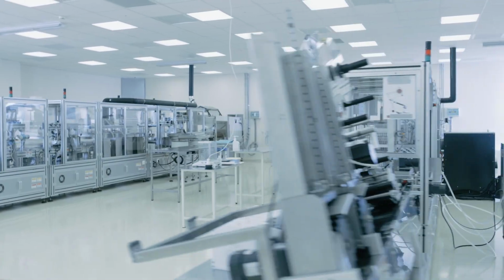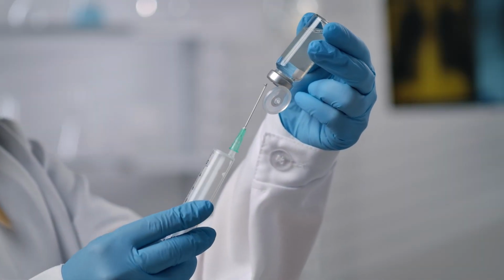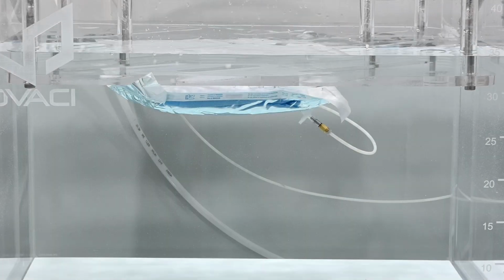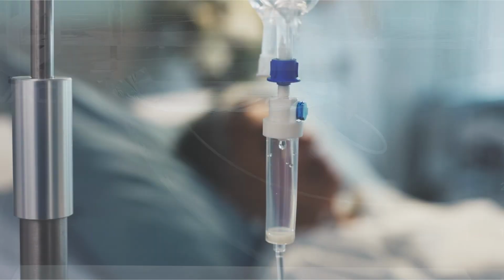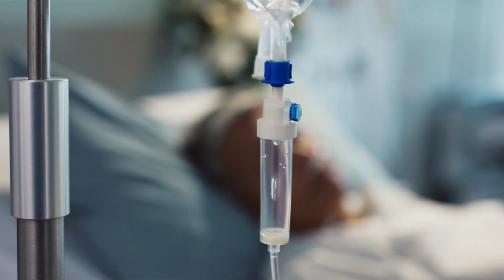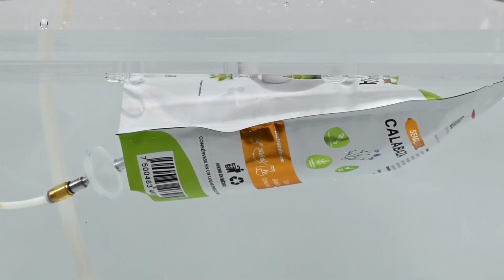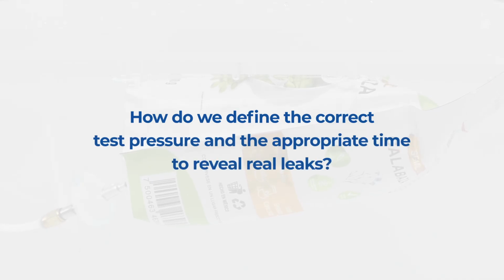In the pharmaceutical industry, we all share one responsibility: ensuring that every sterile package maintains its integrity until final use. A leak is not just a defect, it is a regulatory nonconformance, a risk to the patient, and a problem no one wants to face. And that leads us to a fundamental question: how do we define the correct test pressure and the appropriate time to reveal real leaks without damaging the package?